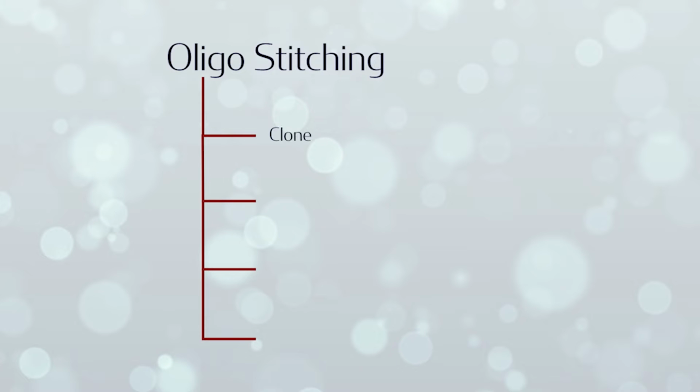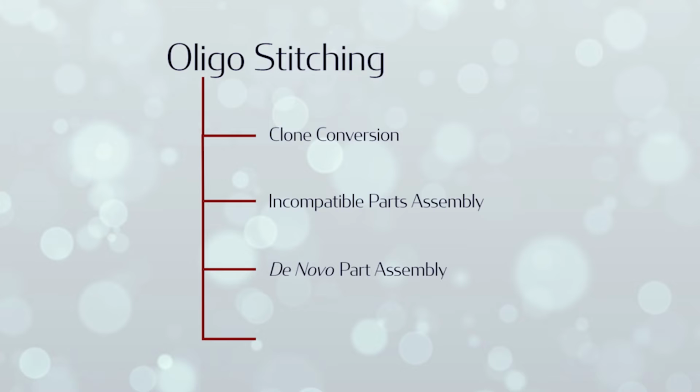1. To convert Golden Gate parts between different assembly standards. 2. To directly assemble incompatible Golden Gate parts. 3. To generate de novo sequences without PCR amplification. And 4. To domesticate plasmids. In other words, to remove restriction enzyme recognition sites that interfere with Golden Gate cloning. This last application can also be extended to perform saturation mutagenesis. I'll briefly explain all 4 applications for you.